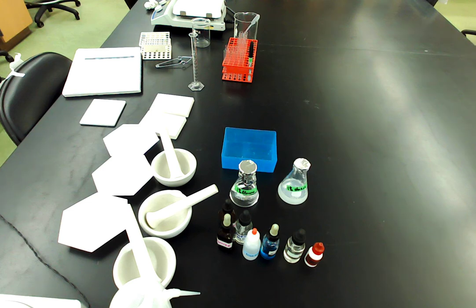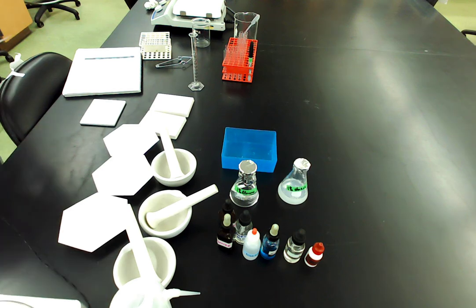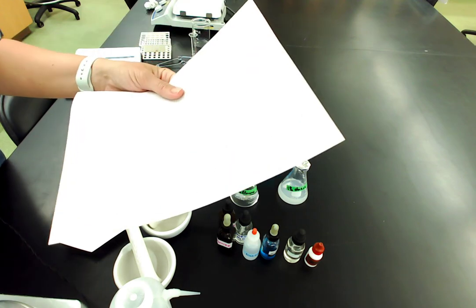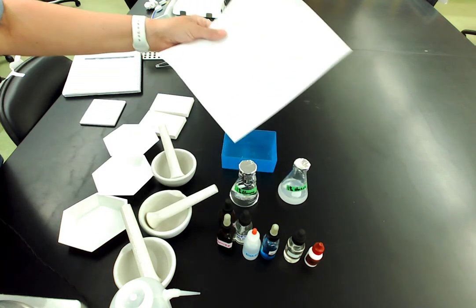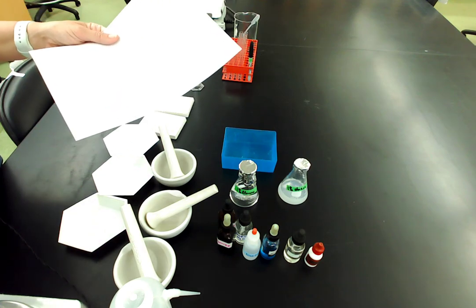I have a paper and a pen. And I'm going to show you how to make a list to keep track of what all these different substances are and what we're doing with each one. Okay? I'm going to switch cameras.